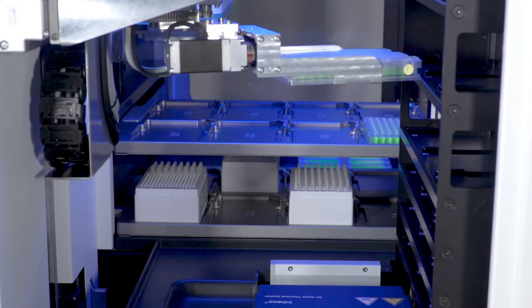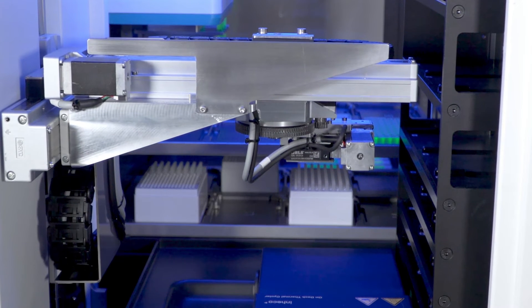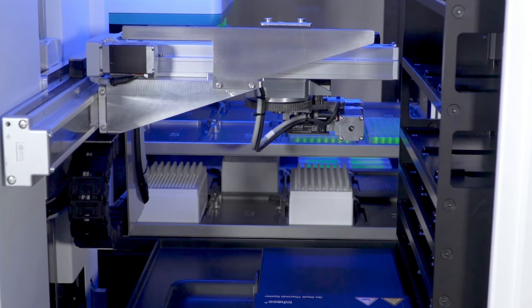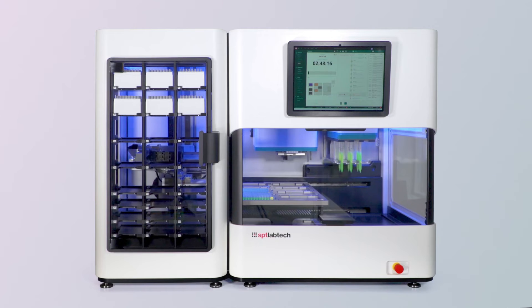With the Firefly PLUS module we've significantly expanded the number of deck positions that can accommodate various pieces of SBS footprint labware. Before we can perform liquid handling, the automation-friendly lid will need to be removed. This is performed by the gripper from the Firefly PLUS module. The lid gets picked and can be returned to the shelves in the expansion module.